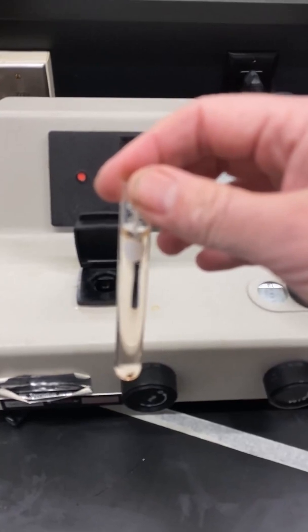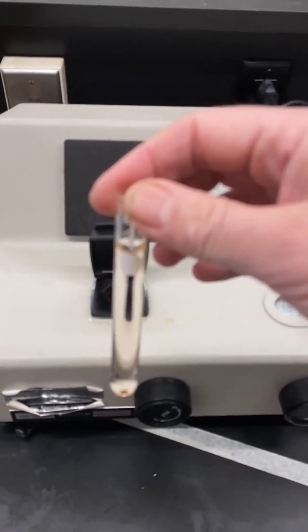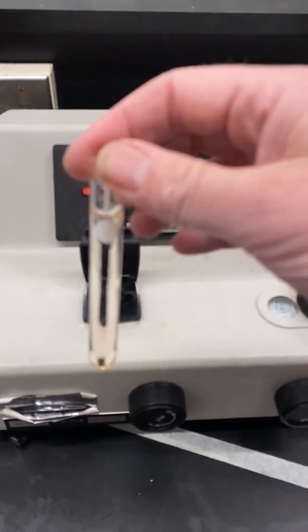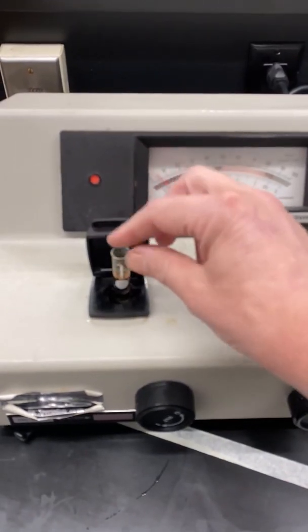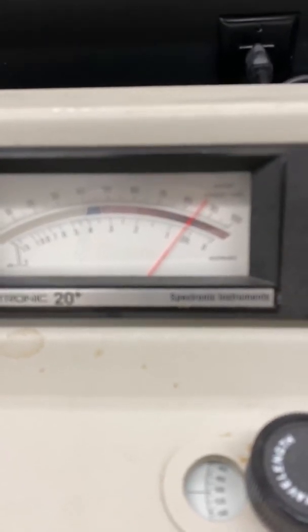Fill the cuvette with solution A and dump it out in the sink — this is conditioning the cuvette. Then fill the cuvette again with solution A up to the solid circle. Wipe off the outside with a Kim wipe. Then, making sure you have the stripe facing you, place the cuvette into the spectrometer and close the lid.